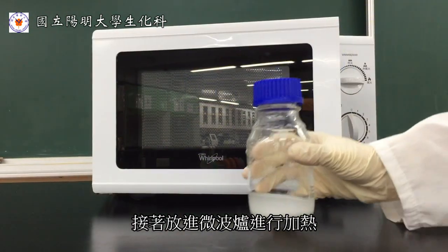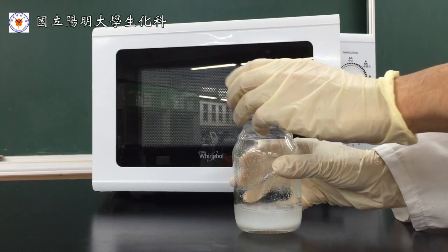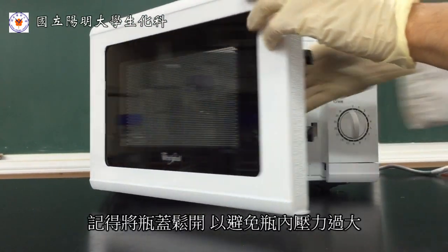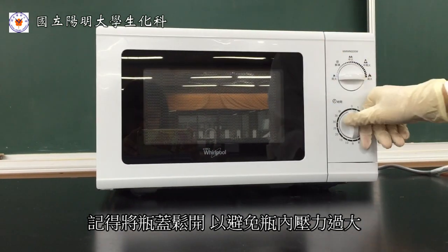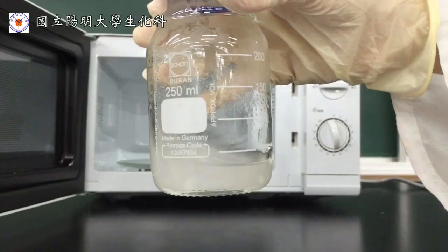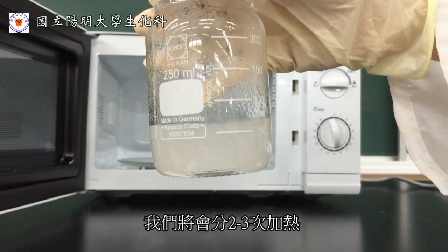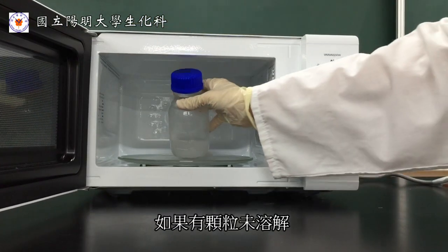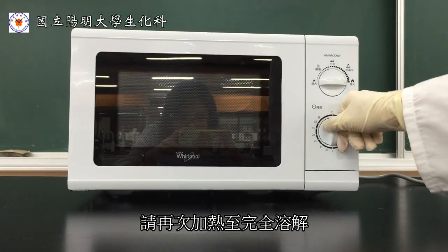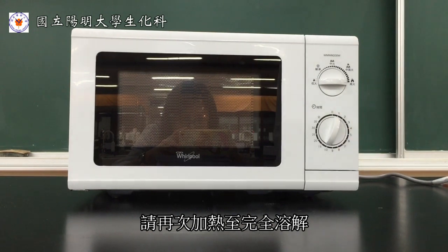Now it is ready to be heated inside the microwave oven. Note that before the heating, the lid ought not to be firmly locked, in avoidance of ultra high pressure in the bottle. The heating process may be subdivided into two to three cycles. If solid particles are still observed, please heat up again to ensure the agarose is completely dissolved.